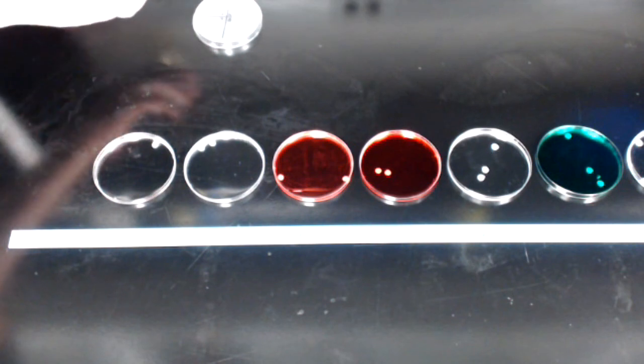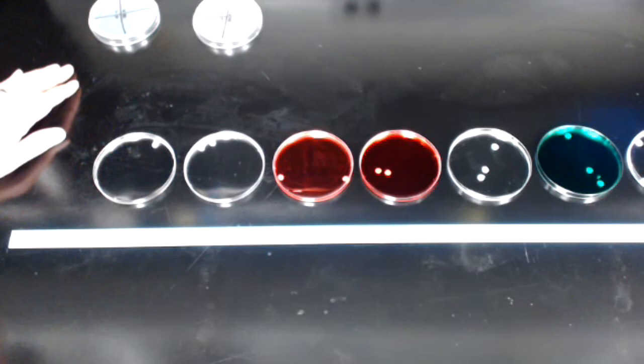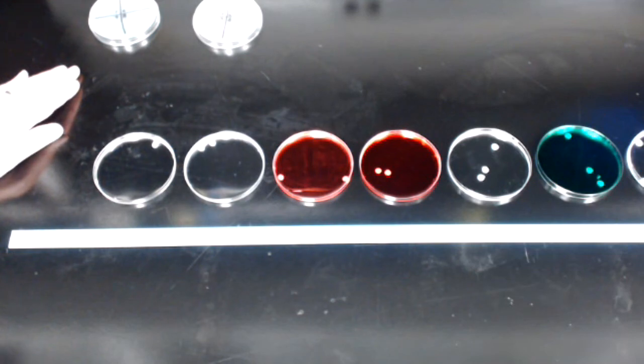Of course, when I'm done, I want to be sure that I have put the lid of each dish back onto the right plate so that the plates don't get contaminated. And then we'll turn around and take all 6 plates and put them in the 37-degree incubator to grow. And then the idea is that if there is any inhibitory effect of the chemical antimicrobial, it will cause a zone of inhibition around the disc.